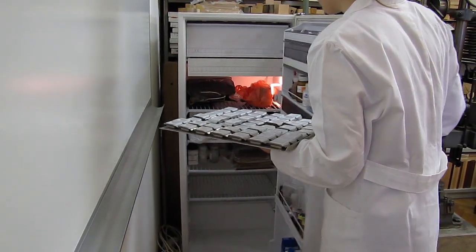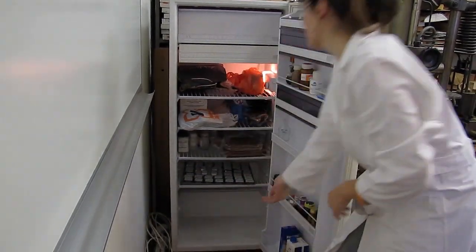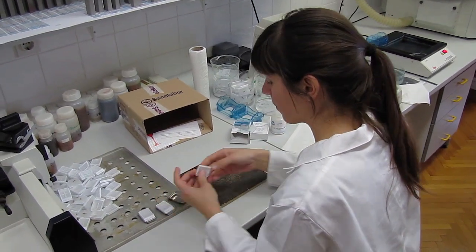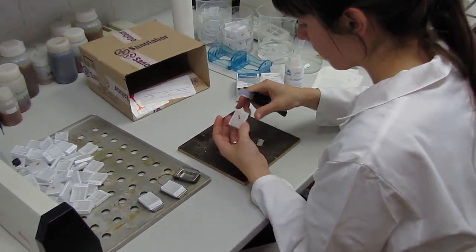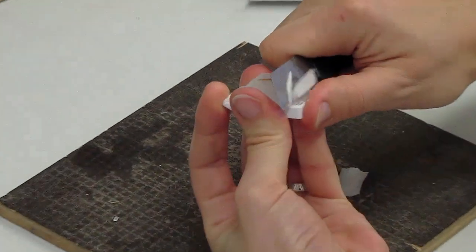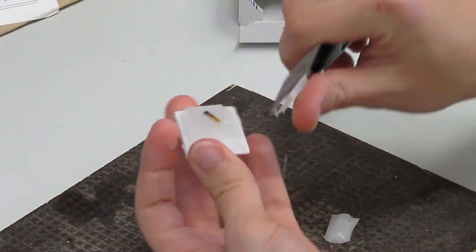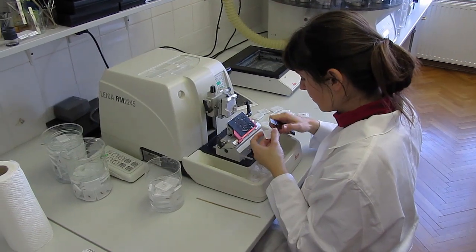After that, the samples should be cooled down to room temperature for approximately half an hour, then placed into the refrigerator or freezer for 15 to 20 minutes. This enables easier separation of the paraffin block from the metal mold. The surface of the paraffin blocks should be reduced with a knife to ensure the smallest possible cutting surface with a trapezoid shape of one square centimeter for optimal ribbon formation at the rotary microtome.